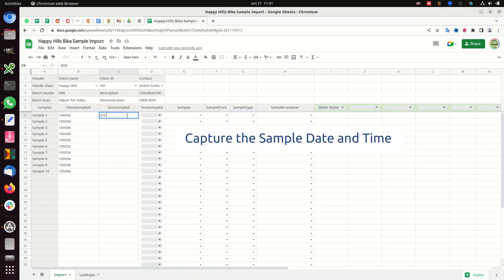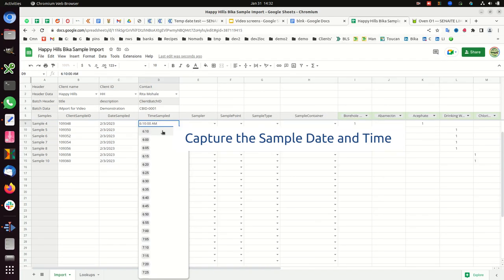Capture the sample date and time. Capture the sampler, sample point, sample type, and container.